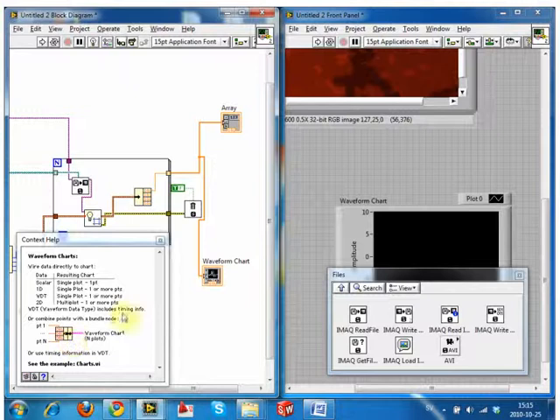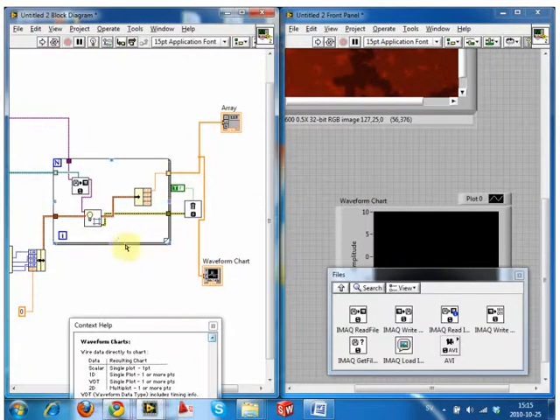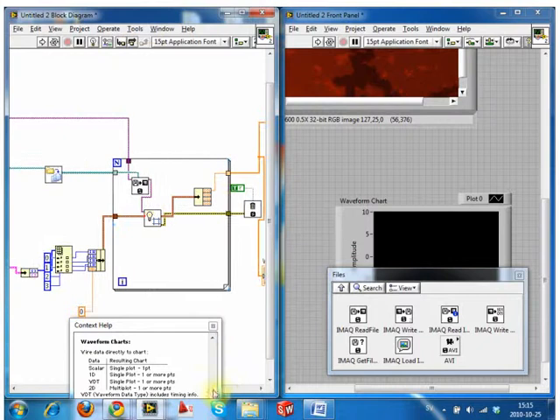Okay, so I think that's everything apart from making a little progress bar. The one that I had built in the example was a simple percentage progress bar. So the way that we did it is we just make a simple progress bar on the screen.